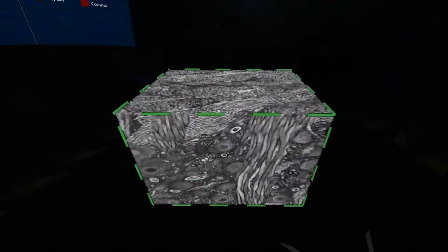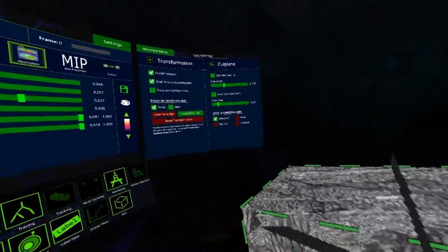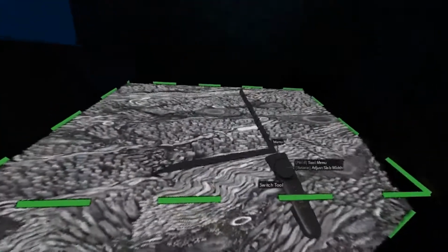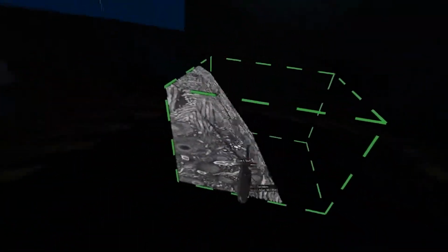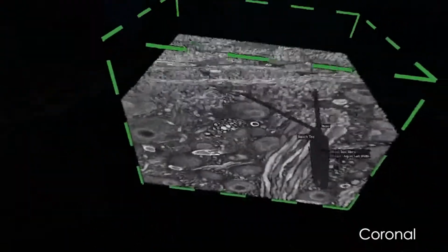If you look at the bottom of your tool settings menu, you'll see a section that says Lock to Cardinal Axis. These checkboxes will allow you to lock the mobility while using the cut plane. The Unlock selection allows for a freehand cut, as you can see, and all the others will fix the plane in that cardinal direction.